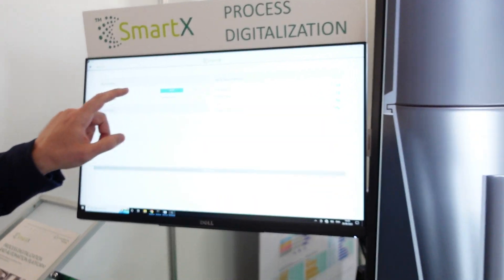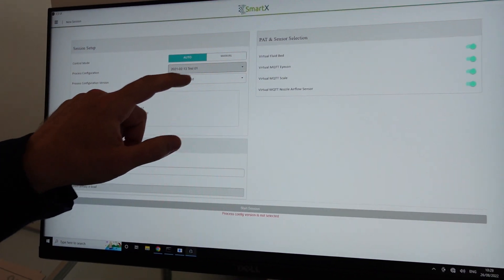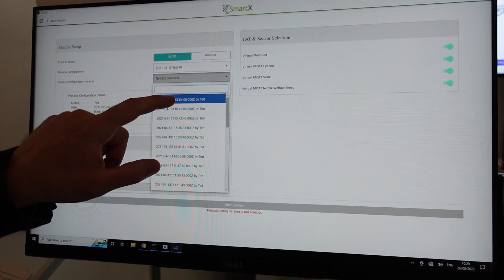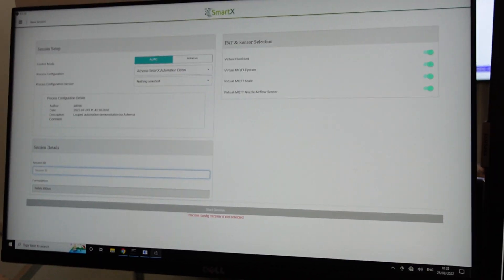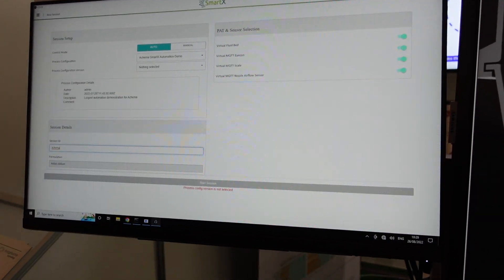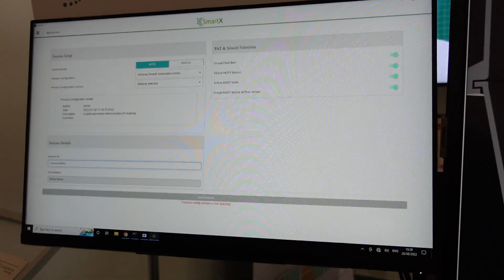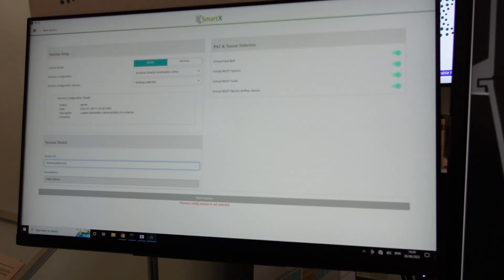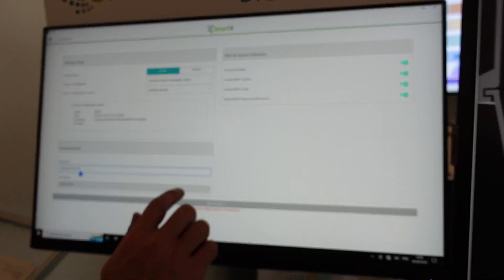We've selected the auto mode, we're going to select one of our process configurations, we'll select the version — let me select the correct one, there we go — we'll give it a unique session ID and click start.